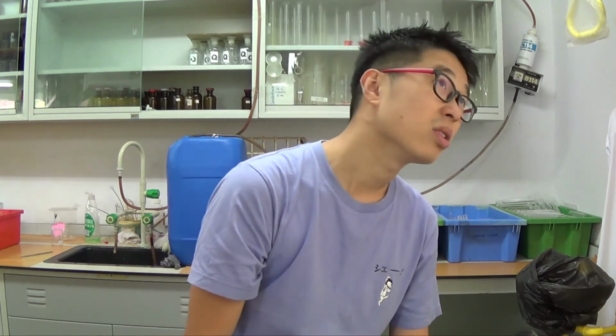In reality, you will be given it in a small bottle or small container, where it will contain the ammonia instead of it vaporizing really quickly. But I don't have that in a small bottle container here. So let me just get started.